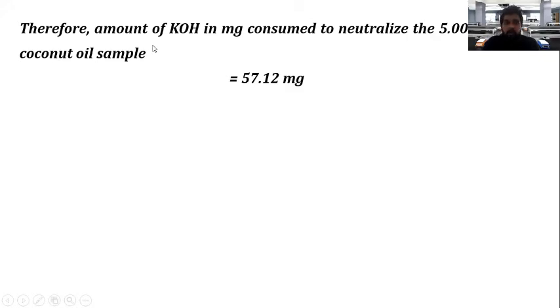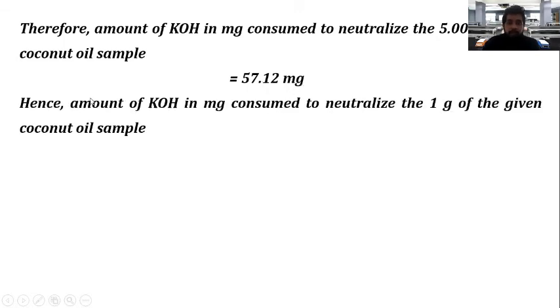Okay, so therefore the amount of KOH in milligrams consumed to neutralize the 5.0010 grams of the coconut oil sample is 57.12 milligrams.